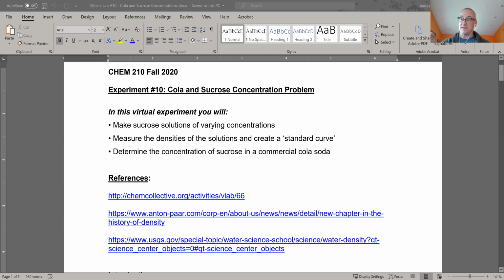Any of those values that you plot on the x-axis have to be, in order to plot something, that value has to be what? Measured. Actually, your measurement is on the y-axis. What am I putting on the x-axis?